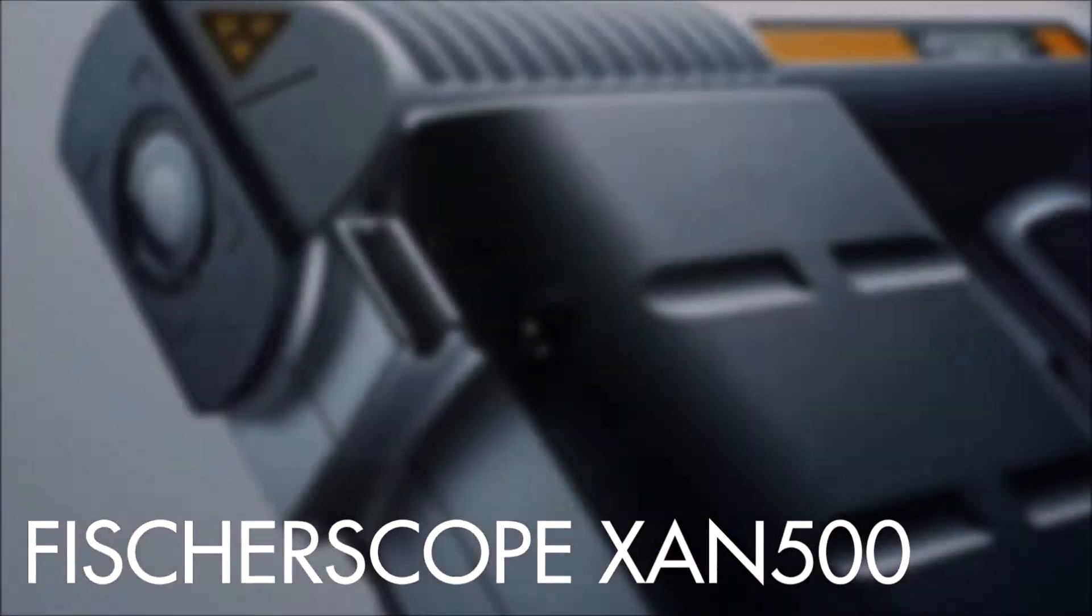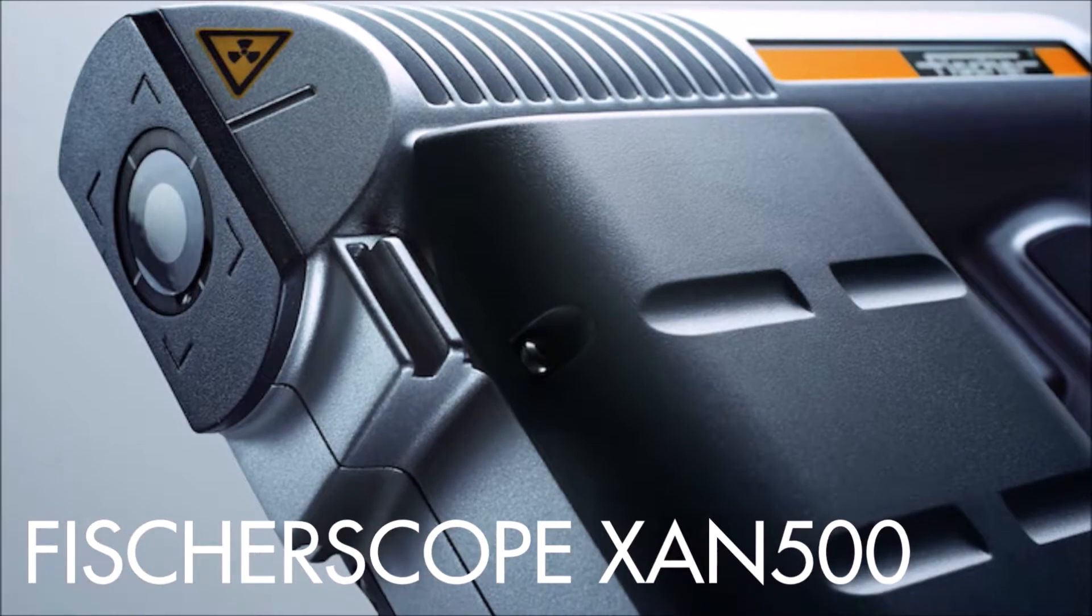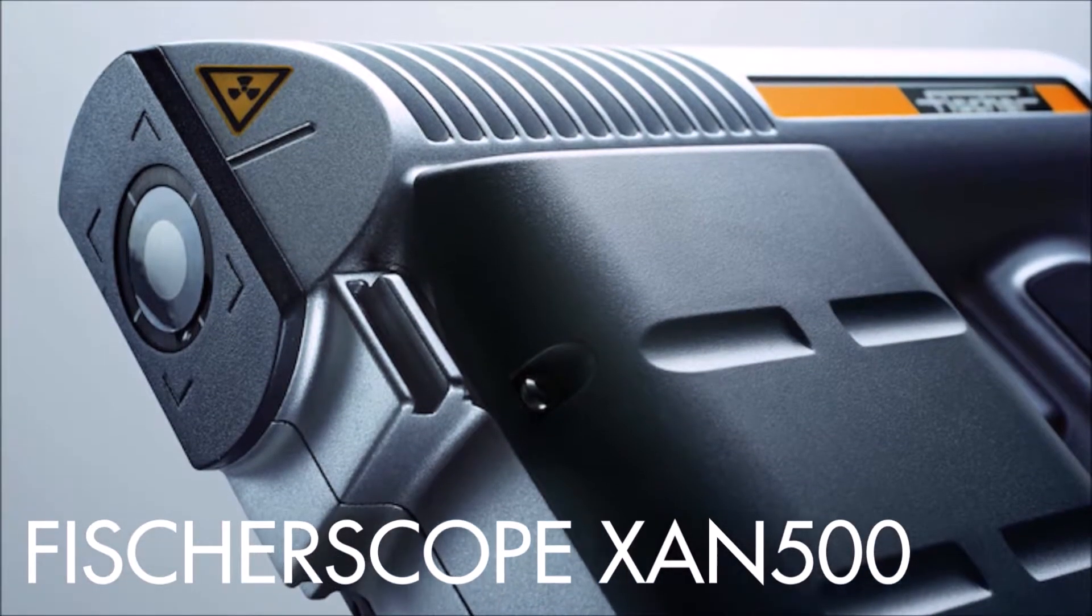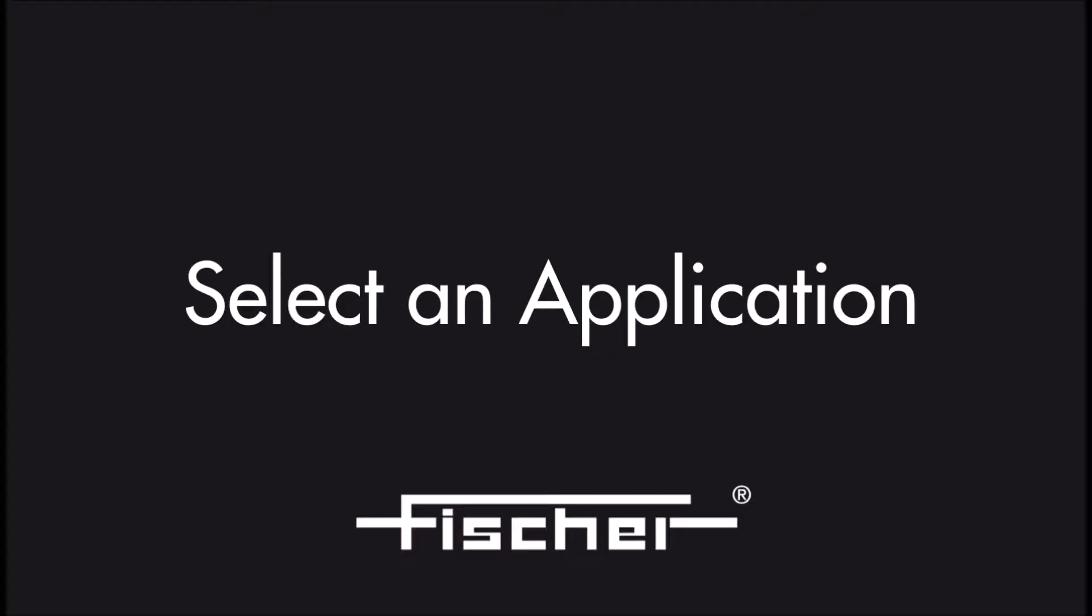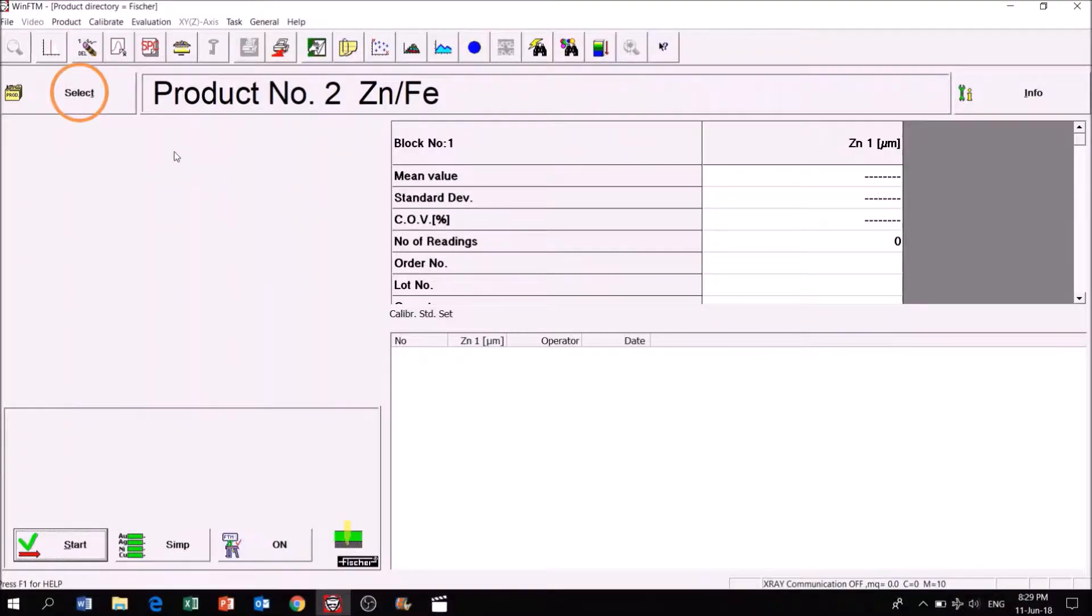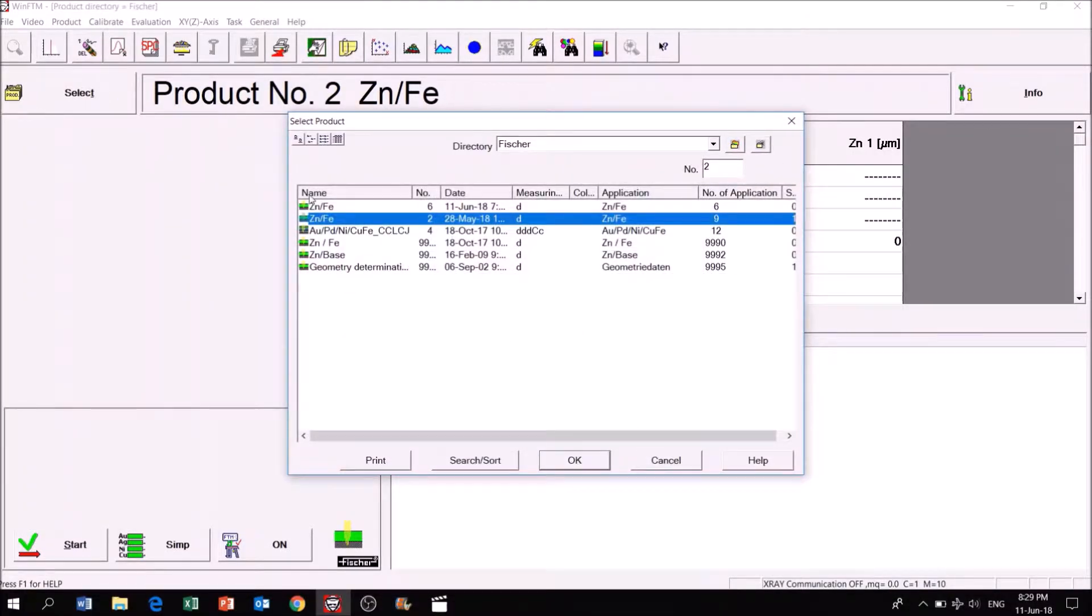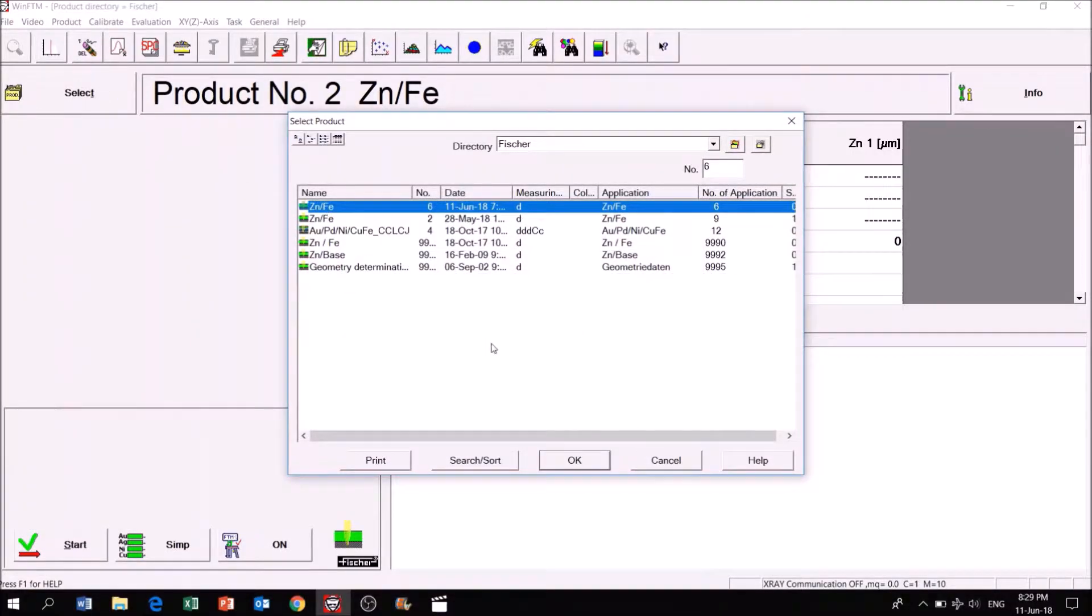Welcome to part 2 of the XAN500 tutorial video series. To start measuring, click on Select to choose one of the pre-configured applications.